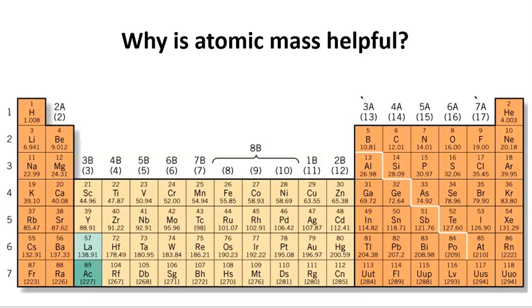In our last lab, we were adding different types of compounds and mixing them into solutions that we were putting in ice and then freezing that compound, like cyclohexane. And then we were looking at the change in the freezing temperature. So we had probes that were looking at that temperature. We're going to use that change in the freezing point to determine the molecular weight of our compound.